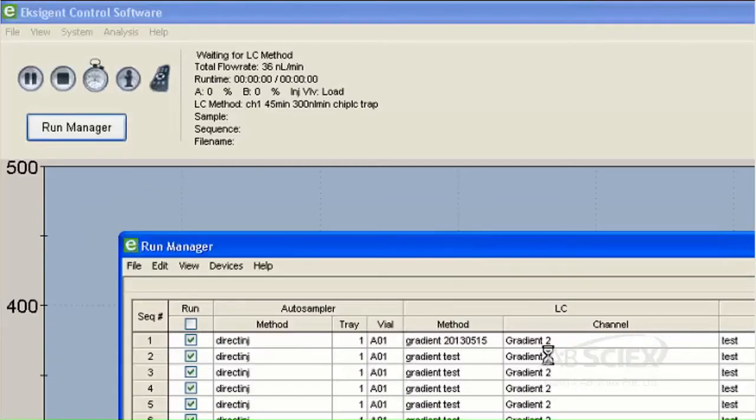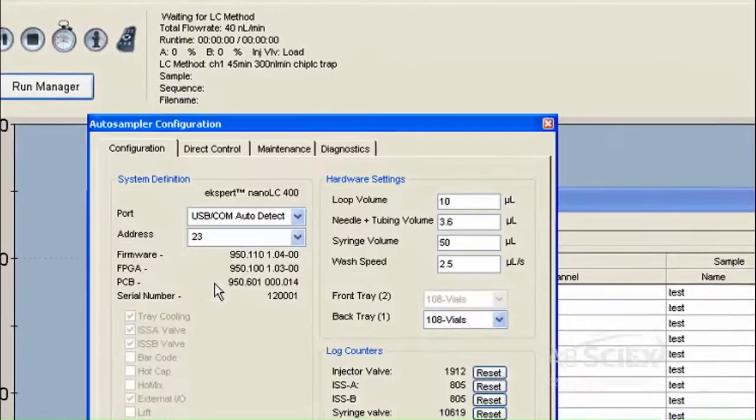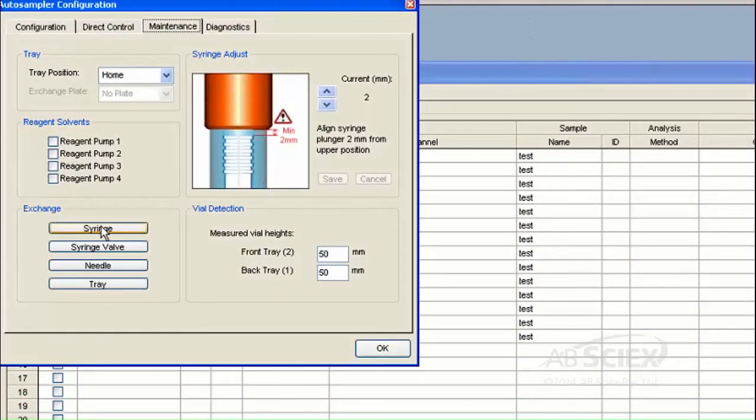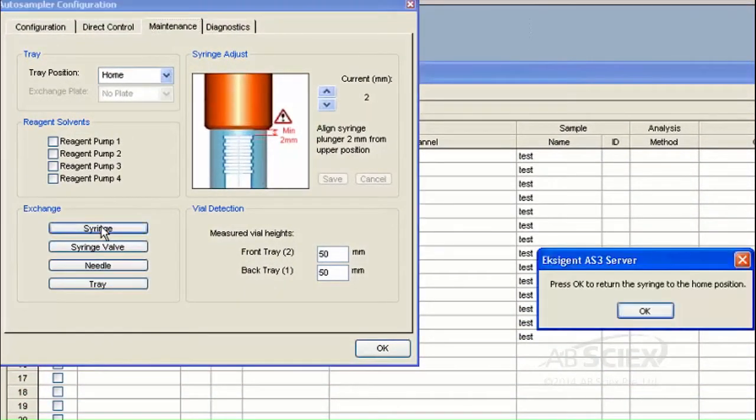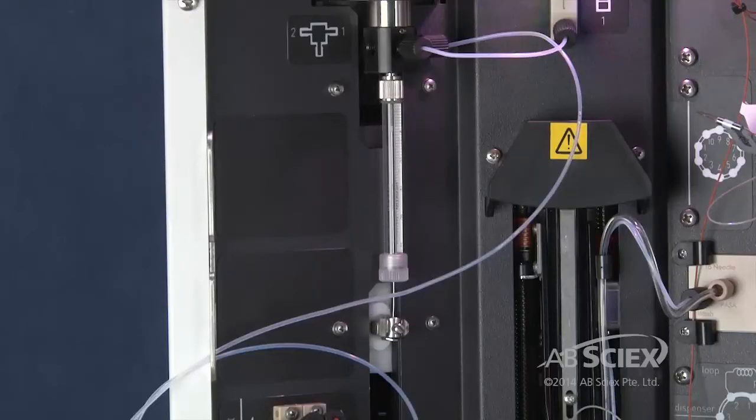Using the Auto Sample Configuration window, click the Maintenance tab, Exchange Group. Click the Syringe button. This will move the plunger to a position that makes removal of the syringe easy.